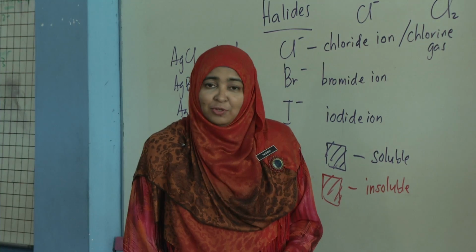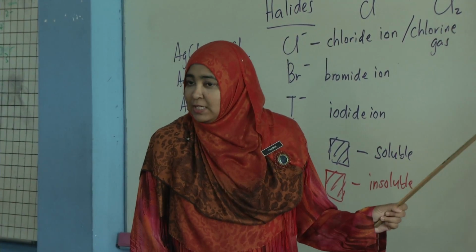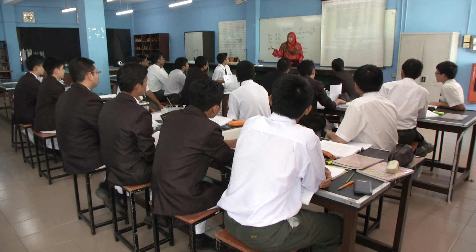No. Okay, what about you, Hanif? Teacher, is this a reversible process? Okay, the process is non-reversible. This is a chemical reaction. Okay, if it's a physical reaction, for example, we have ice.